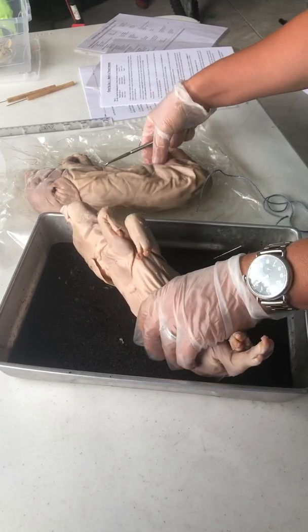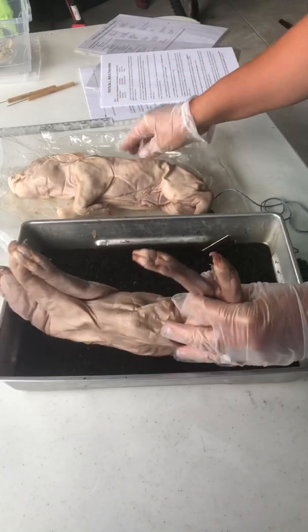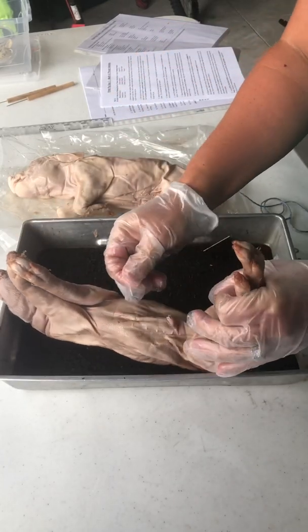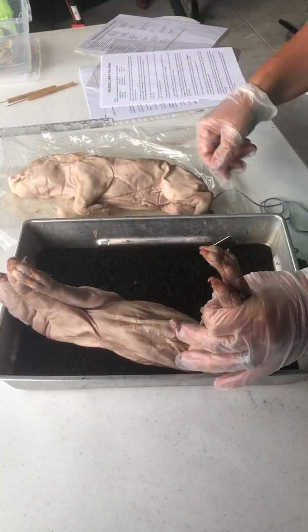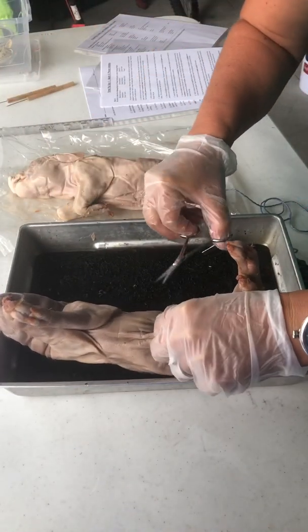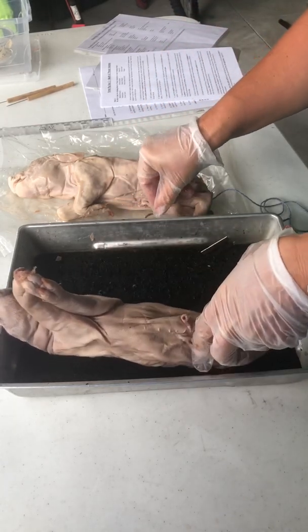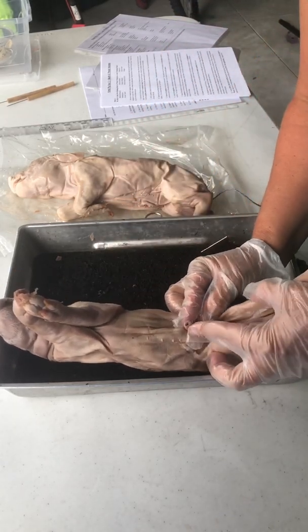We're going to use scissors to cut. I'm going to use this pig. This one is a little bit better. I'm going to use scissors to cut this umbilical cord so we have a clean break. And we're going to look at the structures inside the umbilical cord.